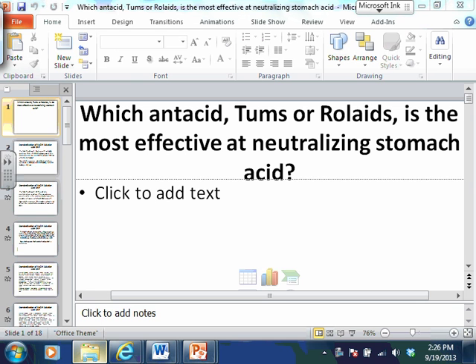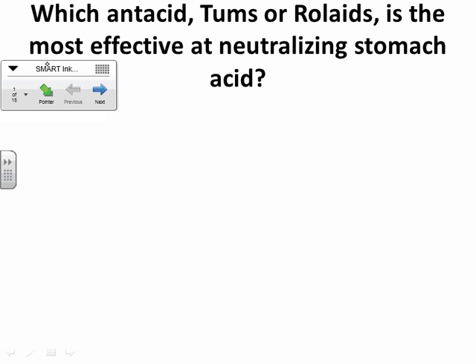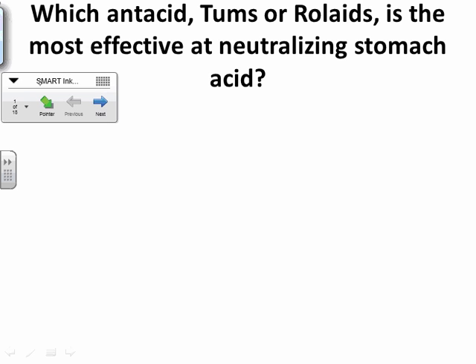We'll talk through this Tums and Rolaids pre-lab, just part 1 and part 2 of the pre-lab. We'll do part 3 tomorrow. So the question really is, is Tums or Rolaids better? Is Tums or Rolaids better? I don't know. This isn't grammar class.